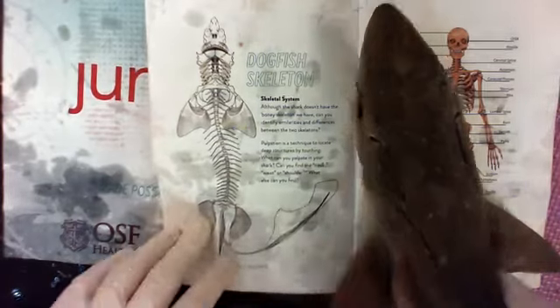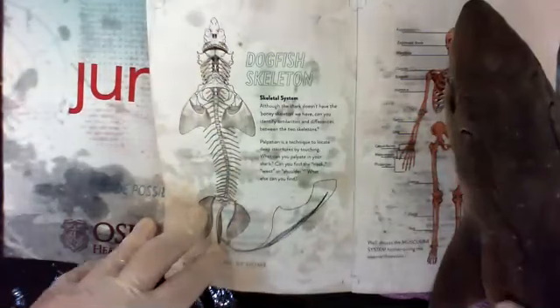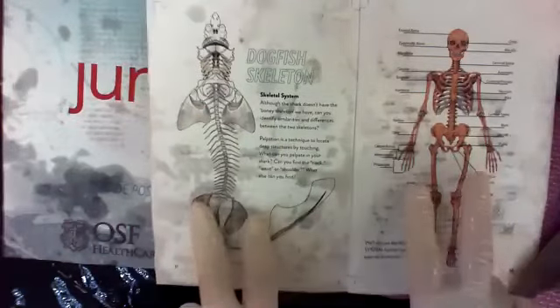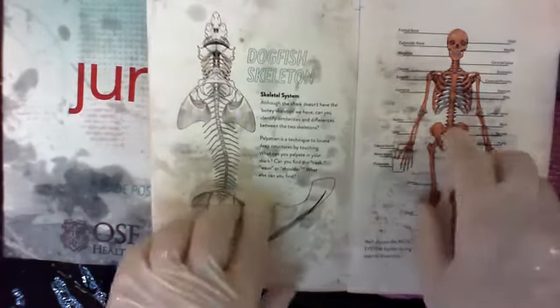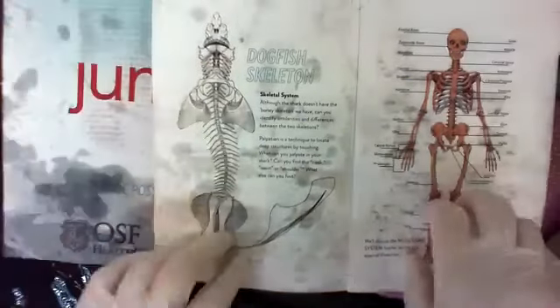Our rib cage protects our internal organs, heart, lungs. A shark doesn't have that. If you pair us up, two arm equivalents, two leg equivalents, right? You have a pelvic girdle area. You have a shoulder girdle, joints that move it. A lot of our structures are very similar.